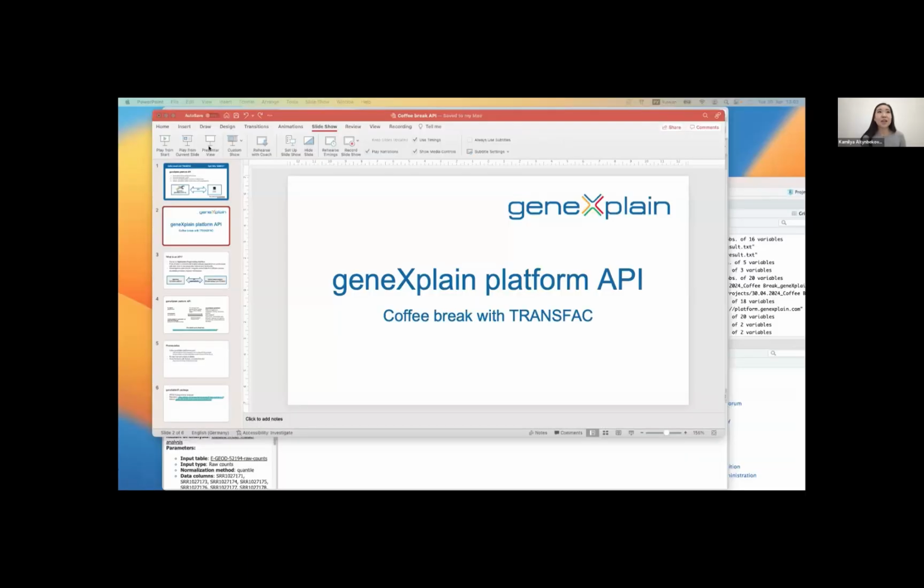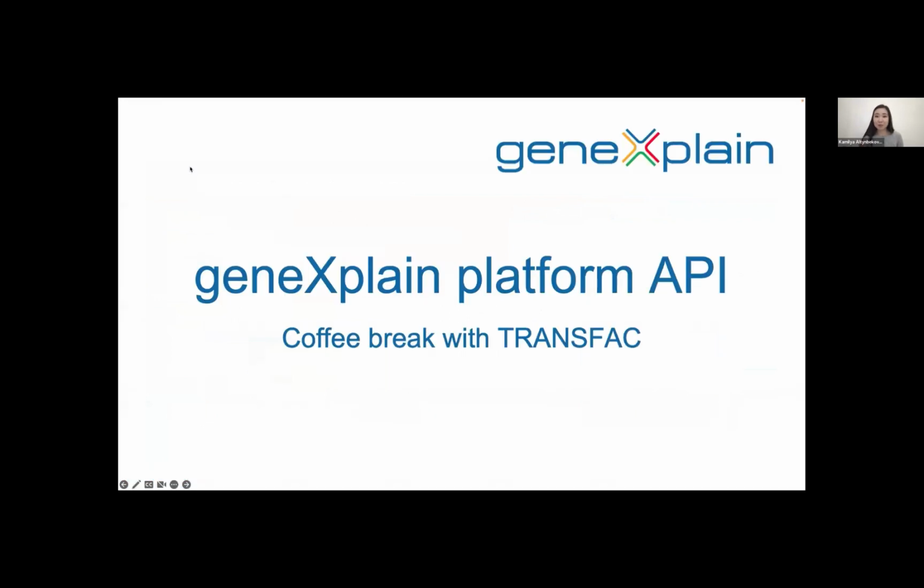Thank you. Hello, everyone. So we're going to talk about APIs today, and maybe you already know something about it, but let me still start with a little introduction to the topic. We're going to talk about application programming interfaces, what interfaces are available for the geneXplain platform, and how you can use them in your analysis.